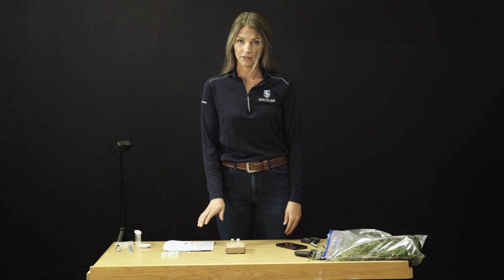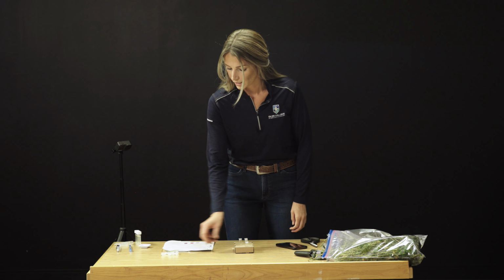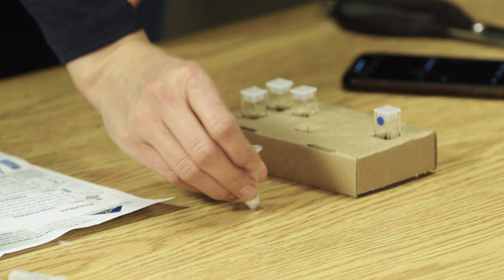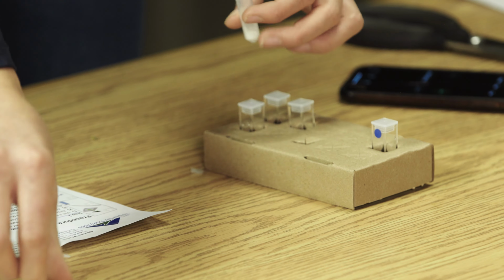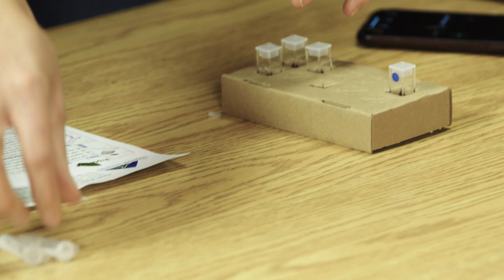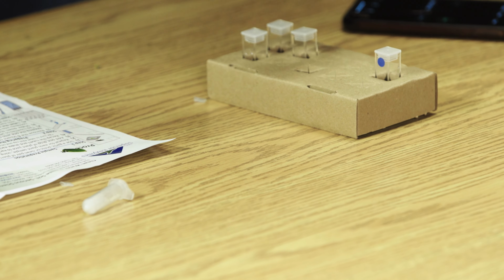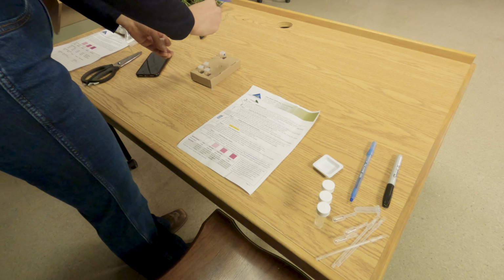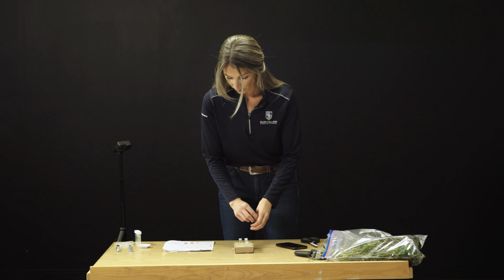Okay, now that we have waited our 10 minutes, we can take our snap cap reagent powder and gently tap them all on the table. We will then take the reagent and add it to each of our cuvettes, including the nitrate standard.